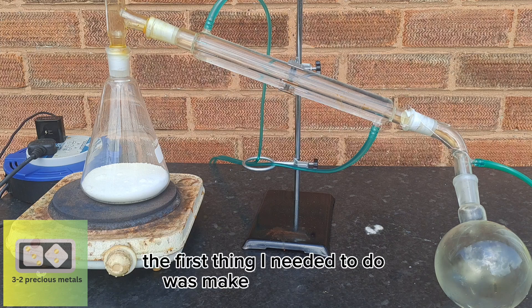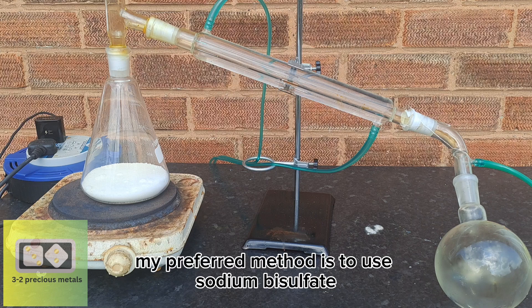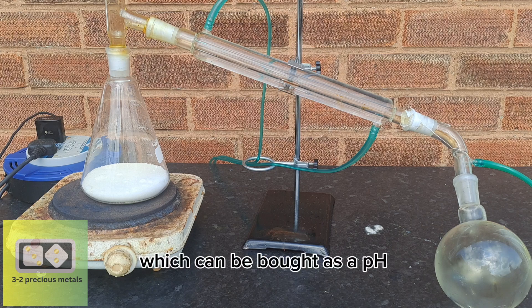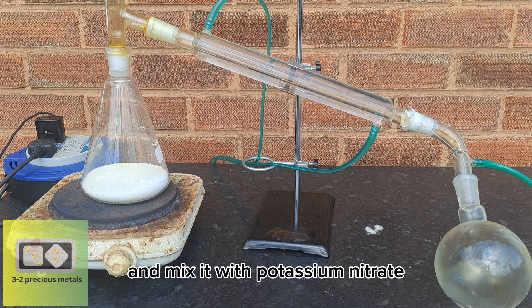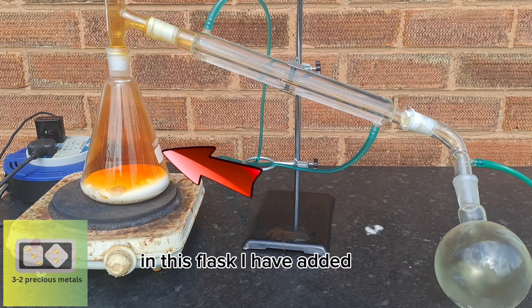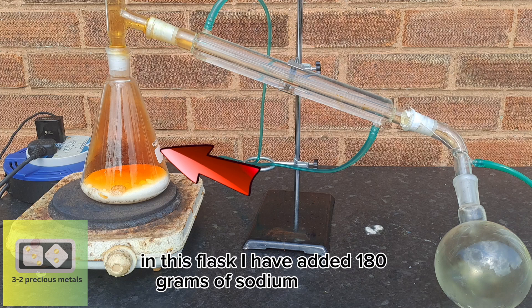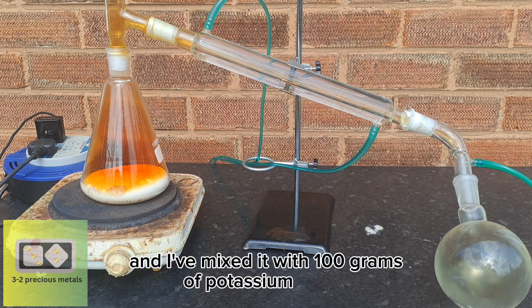The first thing I needed to do was make the nitric acid — there are many ways to do this. My preferred method is to use sodium bisulfate, which can be bought as a pH-reducing chemical for pools, and mix it with potassium nitrate, which is what I've done here. In this flask, I have added 180 grams of sodium bisulfate mixed with 100 grams of potassium nitrate.